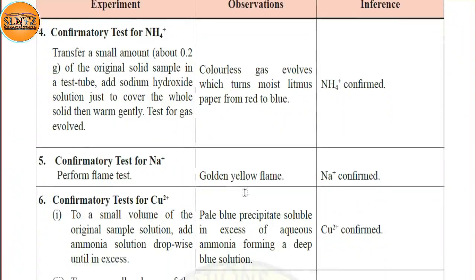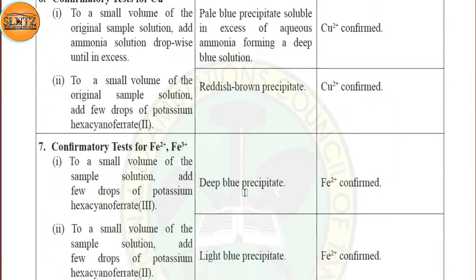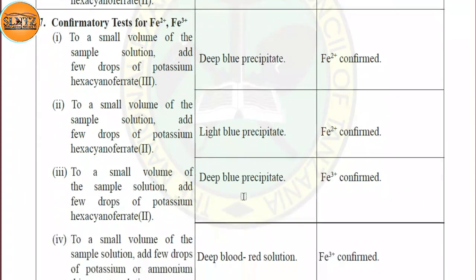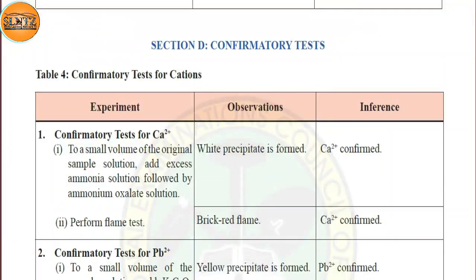But among the ions, the one that appeared most frequently is nitrate. We have seen there is sulfate, there is chlorine, but the one that appeared most frequently is nitrate. So let's go to test how nitrate is tested.